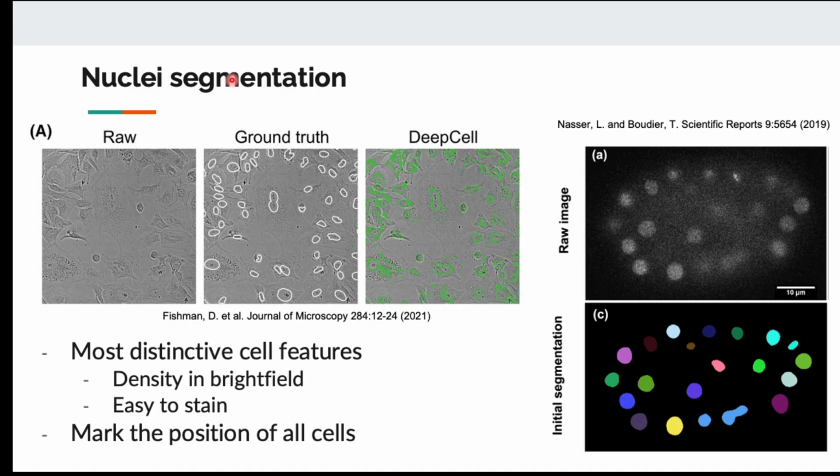First, you need to know where the cells are. So the idea is we have an image that contains maybe just phase contrast image, or maybe standard image. The first thing we want to do is to be able to circle or draw the region for the nucleus or for the individual cells, so that we can analyze other things.